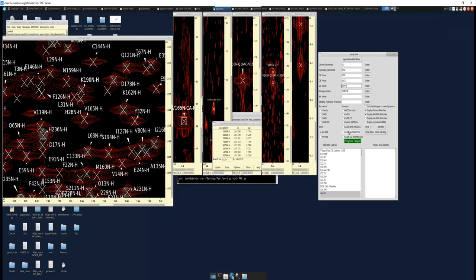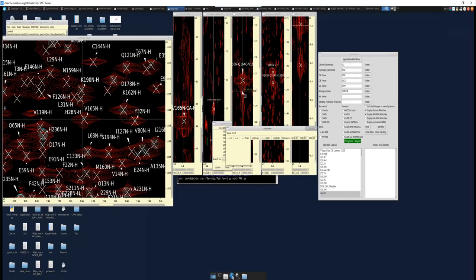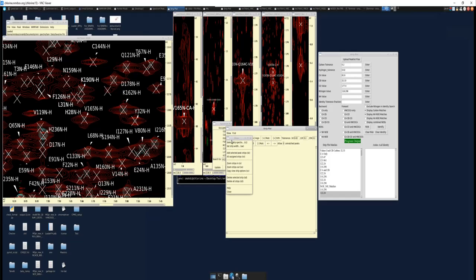Just want to say this is exactly like a strip plot, except here, instead of clicking what you want to search, this is more sequential. So here you do the same thing. I want to search the HNCA, or I want to only search HNCACB, right? Or here I want to search the HNCA and HNCOCA. So it's just different triple resonance experiments that you'll be searching through.